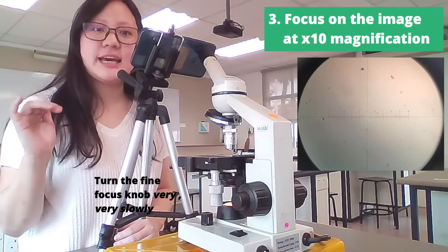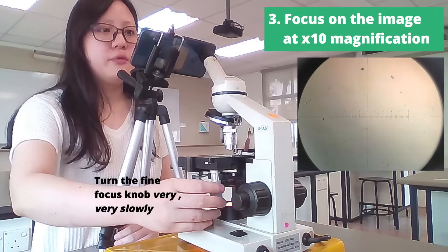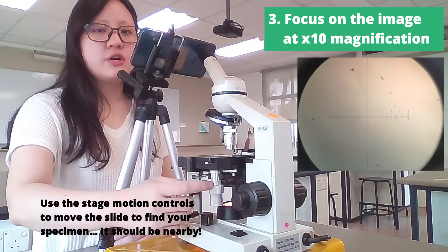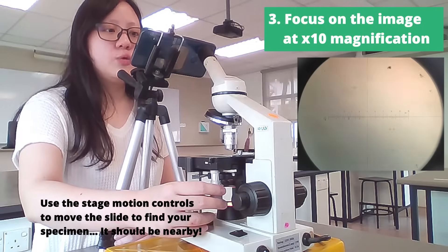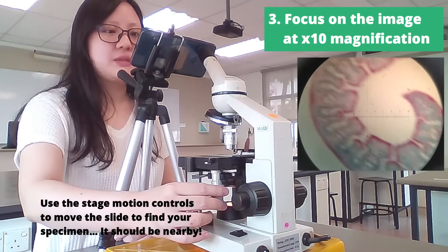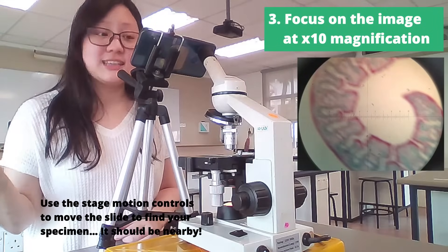Our specimen in this case is dyed bread. We are looking at marram grass today, or ammophila, and you're going to use the silver knobs here to find that specimen. We did put it in the center just now, but it might not be exactly center, so you're going to move it up and down until you see something pink, because our specimen is dyed pink.